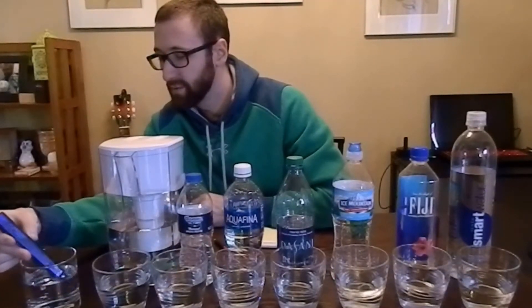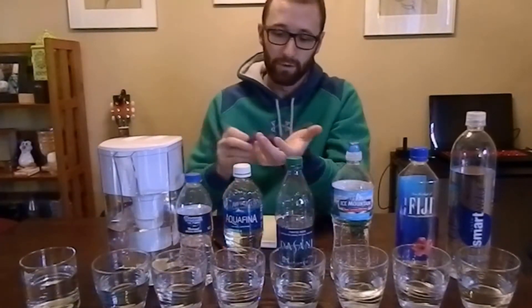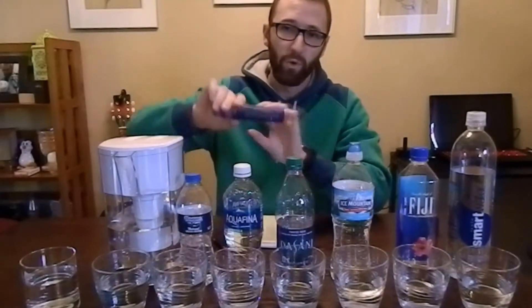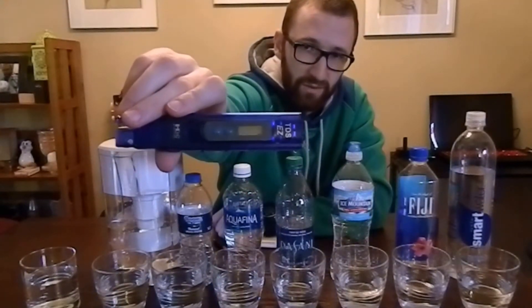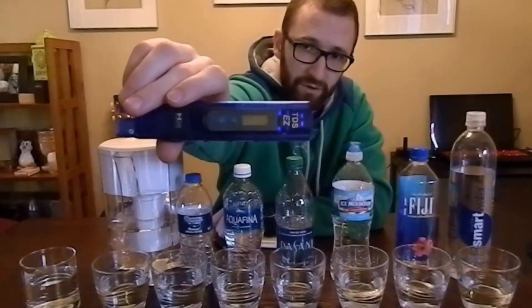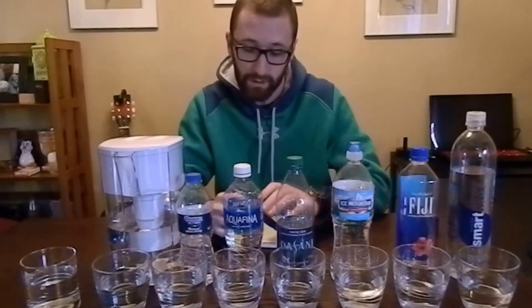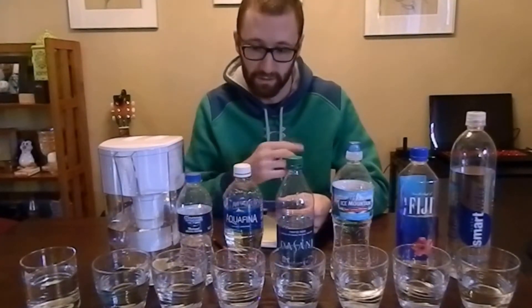The first reading we have here is the tap water — city water for me — as a good reference point for the rest. It comes out to 400 ppm, bouncing between 399 and 401, so 400 is the average. 400 ppm is not the greatest, but it's definitely still drinkable. It's under 500, it's not really going to do you any harm — definitely not purified water, and you'll see what I mean as we continue.